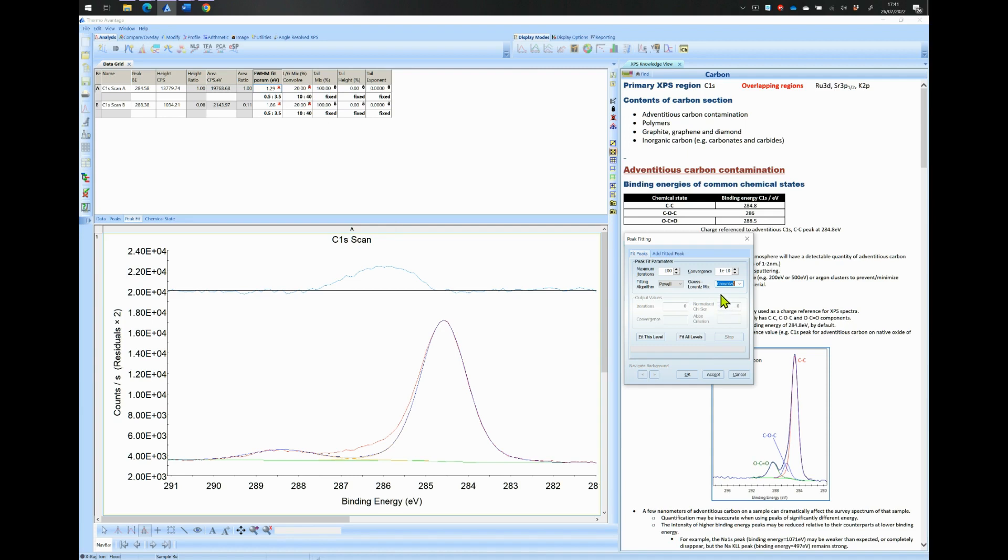Now before fitting our data, we need to change the range at which the width or FWHM and the LG ratio is allowed to vary. The rule of thumb is that all peaks have usually the same or similar width and LG ratio.